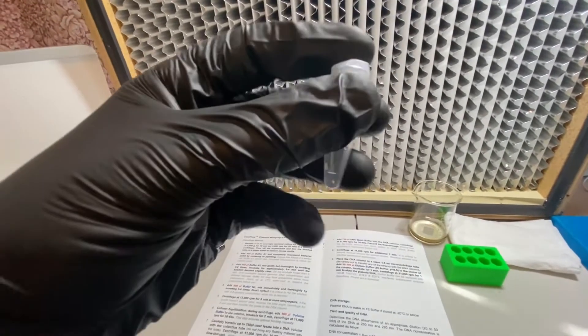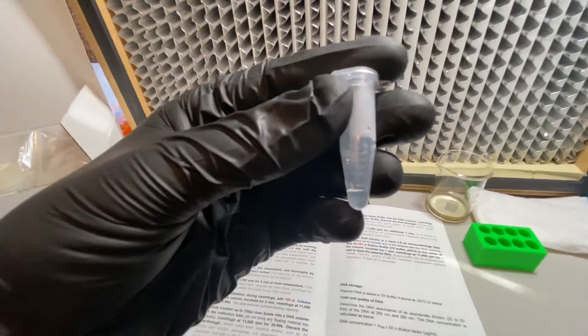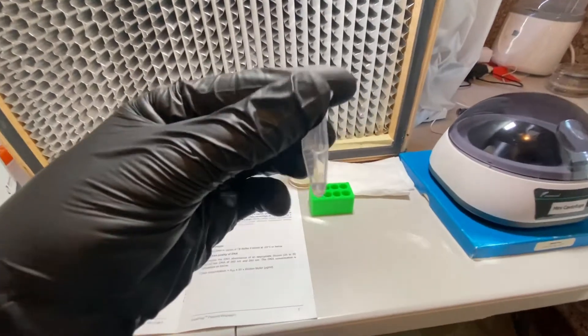After following the protocol for this special mini prep kit targeting low copy plasmids, we now have 80 microliters of hopefully concentrated Spanish plasmid. Now I can set up a gel and get a good estimate of the concentration so we can continue our transformation experiments.